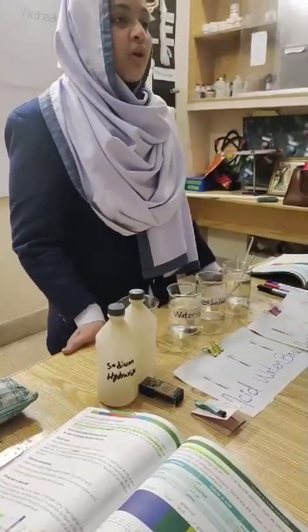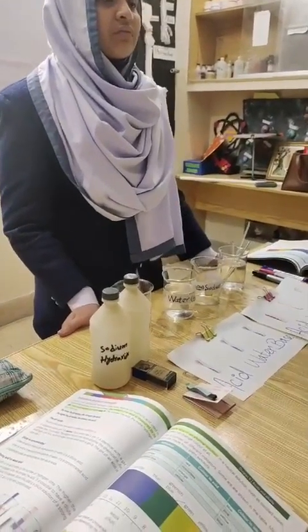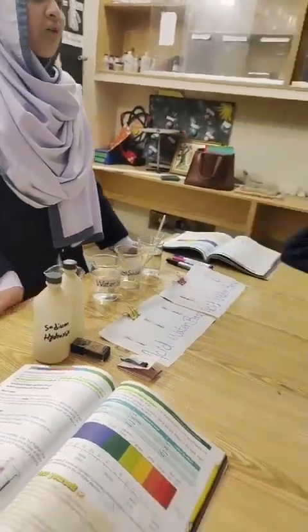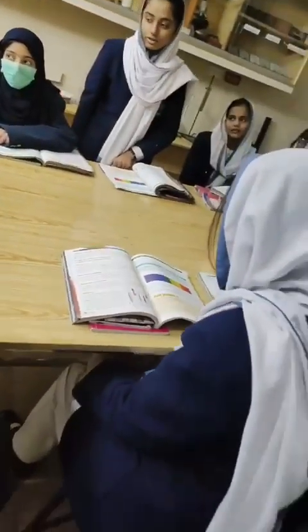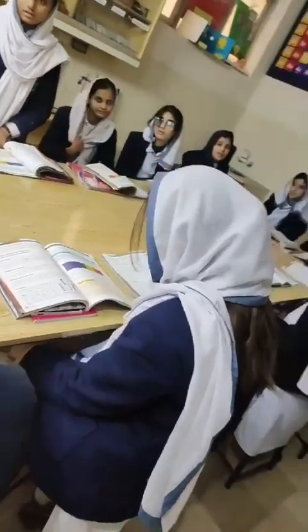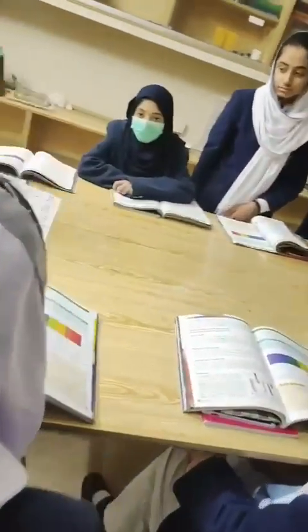Assalamualaikum all of you. Waalaikum warasalaam. How are you? Alhamdulillah, we are fine. These are blue litmus papers and these are red litmus papers.